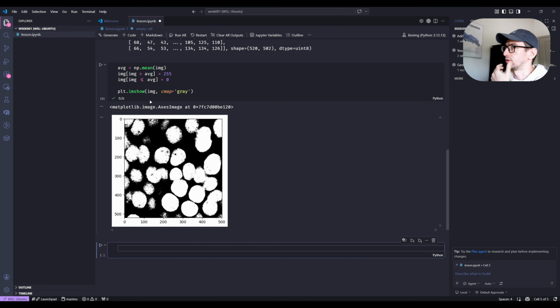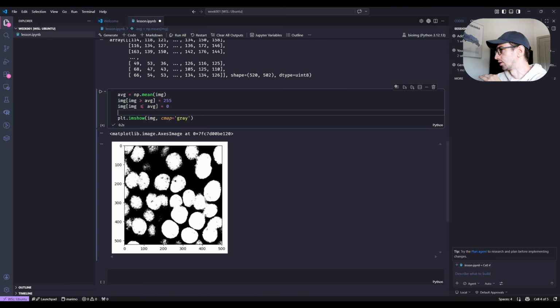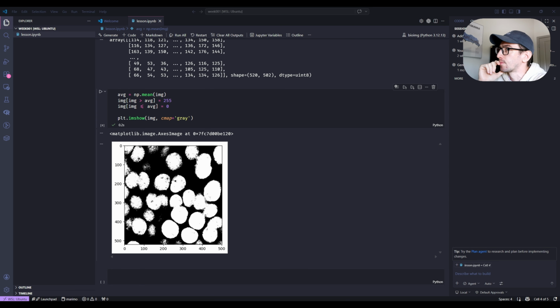So, Ivan, it should be simple, but can you just explain what's happening here? Every value in the image that is below the average gets 0 value, and above gets 255 value. That's all. Okay. So guys, any comments about this part? I mean, about the solution and maybe in general. Do you have any concerns maybe?